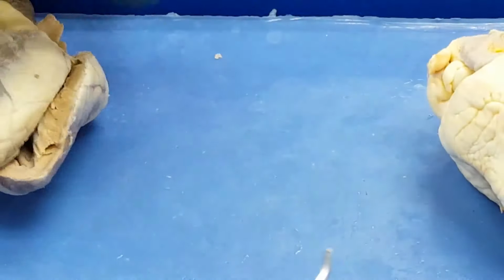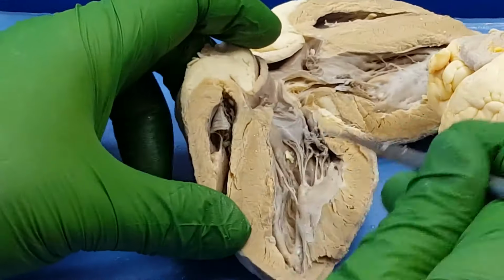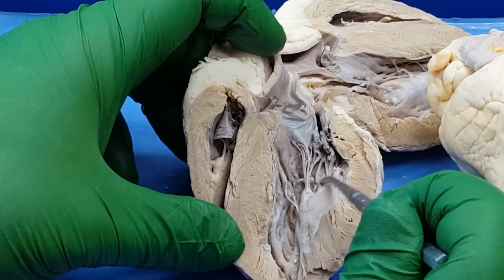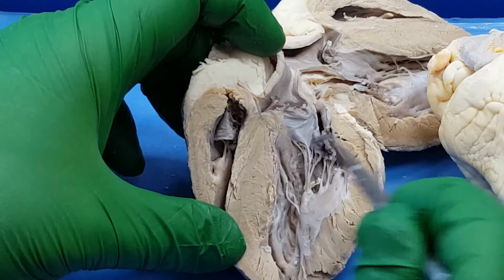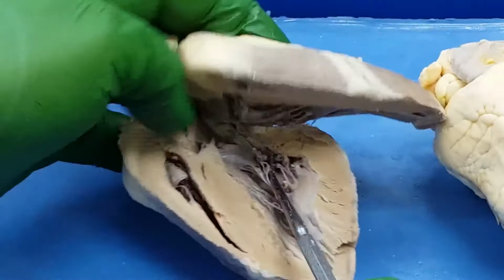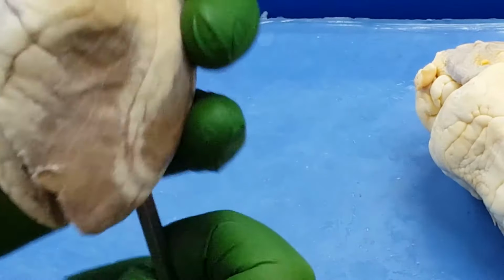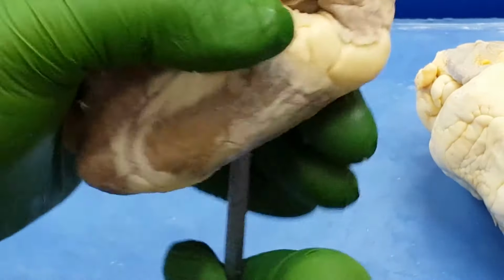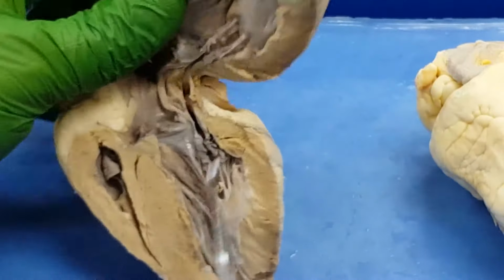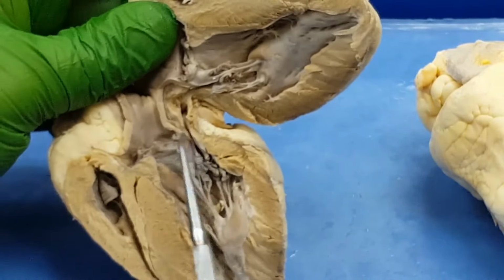So the 2 valves that separate the atrium from the ventricle on each side, remember, I'm going to see those cords attached to them. So the chordae tendineae right here are anchoring the mitral valve's flaps. And then watch my probe, everyone. If I simply move my probe up through this valve, the chamber that I am in right now, right there, this is the left atrium, right here where my probe is wagging around, above that mitral valve. Everybody look, this is the left atrium.